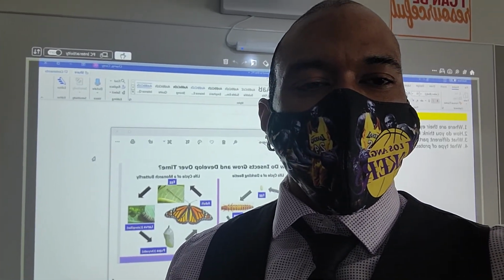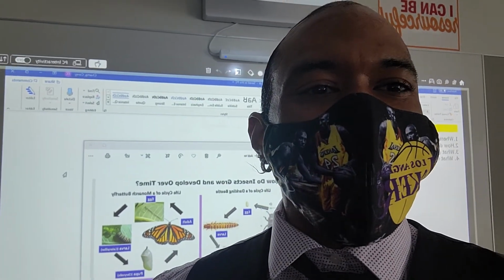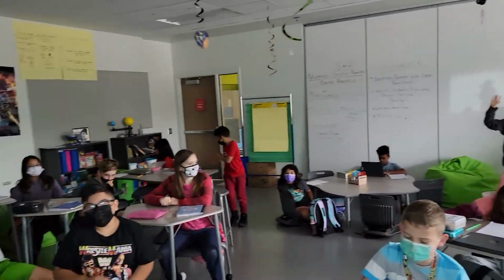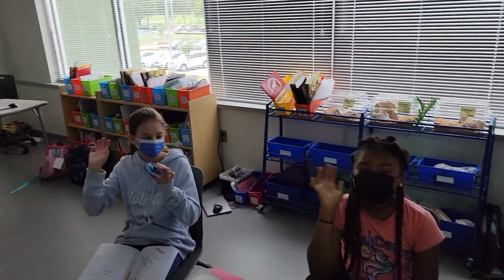We are going to cover our Darkling Beetle Life Cycle Lab. And once again, we have Mrs. Sanchez joining us in our lab. She's awesome. Also, we are here with our young scientists. We are prepared, we are ready, and we are going to get this lab started right now.